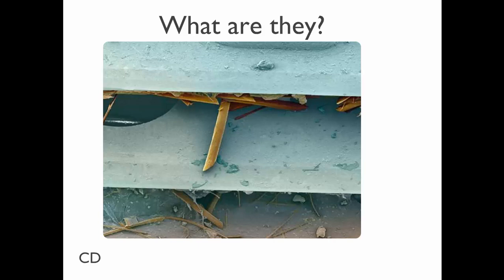Is it a toothbrush? No, you're close. Another hygienic tool. Hairbrush? No. Floss? No. Shaver? Yes, it's a razor. These are the blades. You could see the sharpened edge. These are little hairs on them.